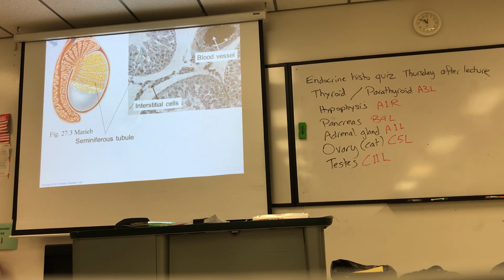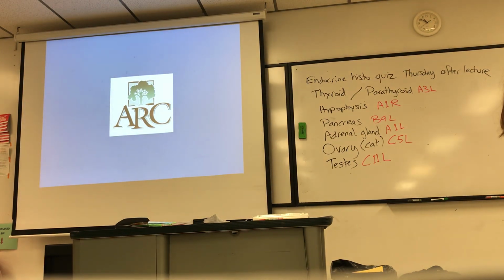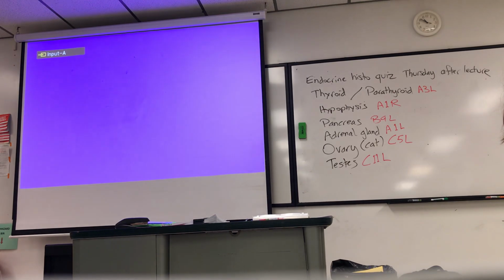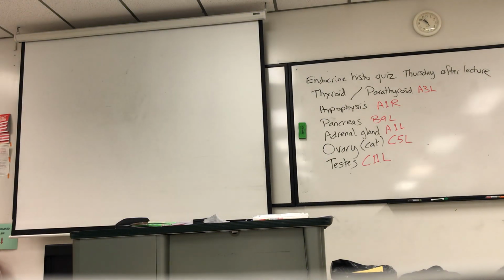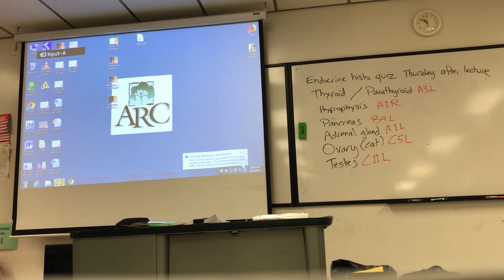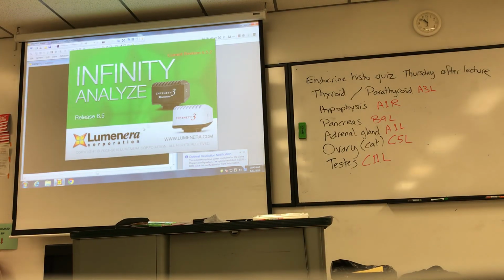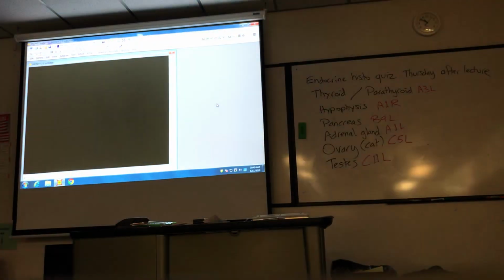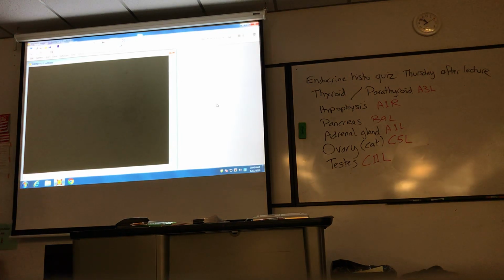Let me switch applications here. There, so that black screen, I'll turn my scope on. I'm going to turn the lights off so you can see the histology just a little better.